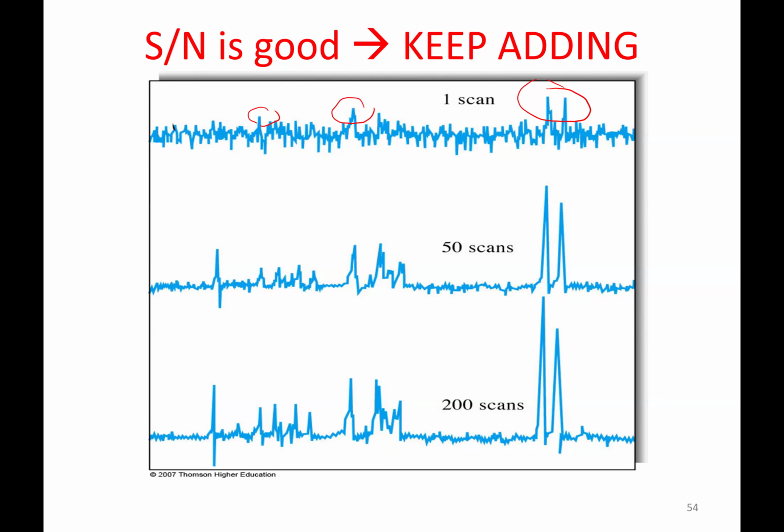If you have 50 scans, what you were suspecting here are obviously true peaks. And here, you notice there wasn't anything, there was nothing here, but now you see a true peak appearing there, right? Because the first diagram is just one scan and it's noisy. Sometimes you will experience this when I work with you on the infrared spectra and other spectra.